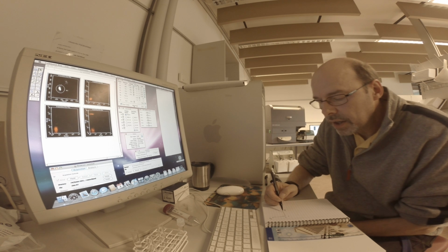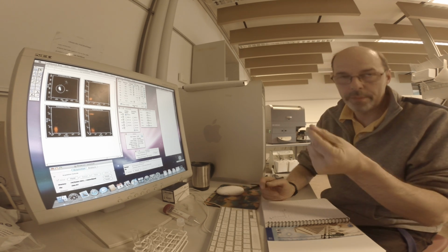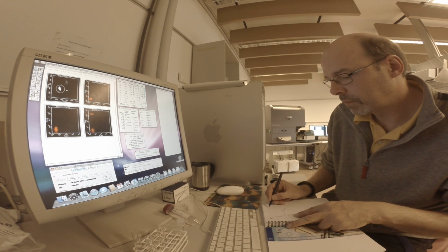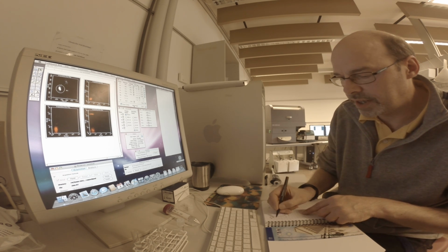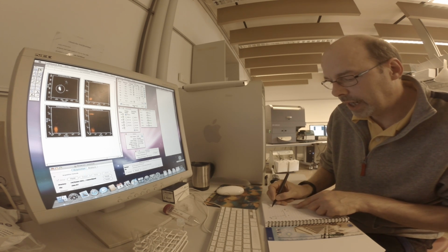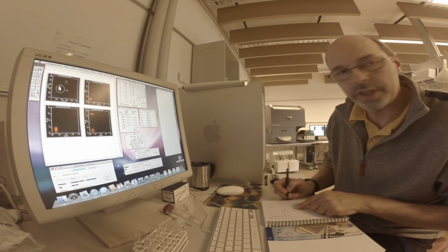So in fact, each dot has 4 numbers, because it has a number for each of the channels. 1, 2, 3, 4. And let's just for fun say that this is 3 and this is 4. Okay. So for FL1 it will be close to 0.